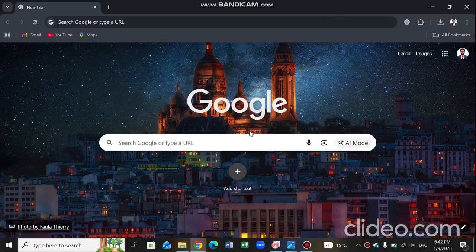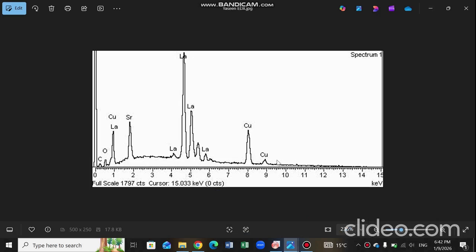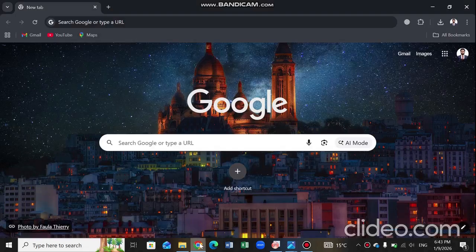Hello everyone, today in this video tutorial I will show you how to digitize the EDX plot and then replot it and organize it. We all know that most of the time we get the EDX plot like this, which does not look good. So to digitize it we will use an online website.